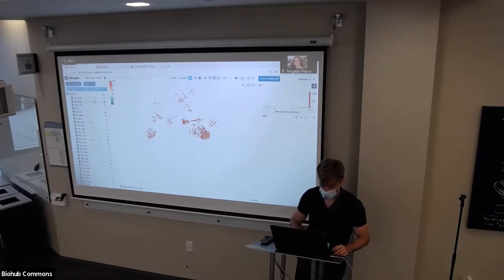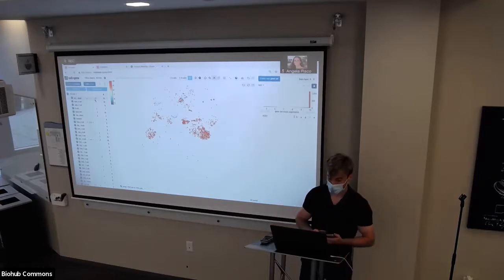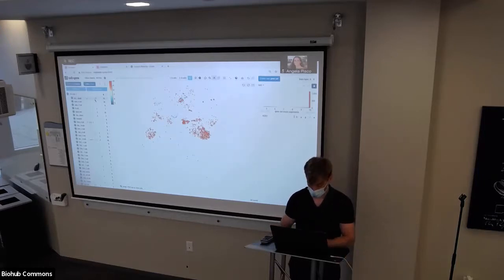It gets a little tricky to use histograms intuitively when you have such sparse data. But if you had a gene set, which tends to be a more continuous distribution, since it's an average of many genes, then these histograms would look nicer. And yeah, I wrote down the sortable category.